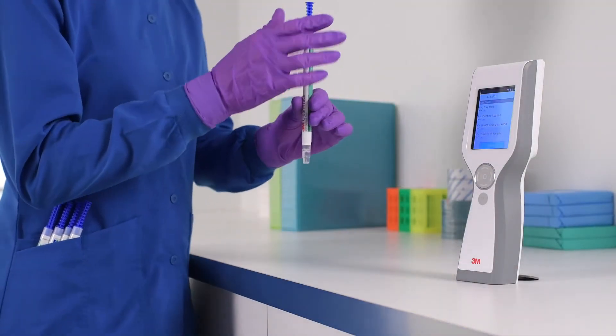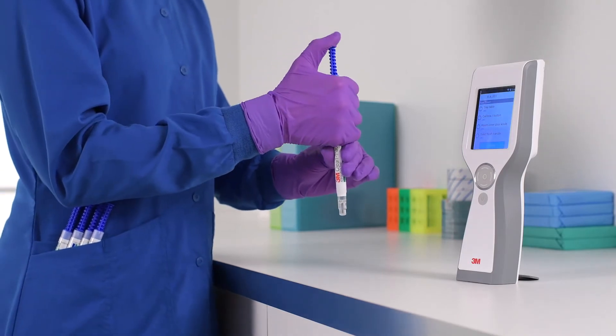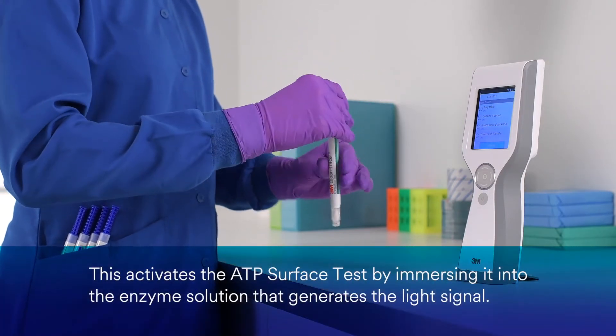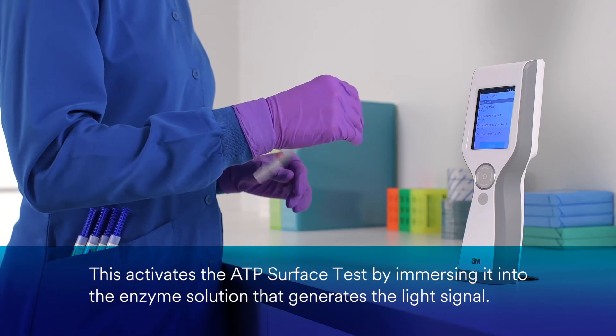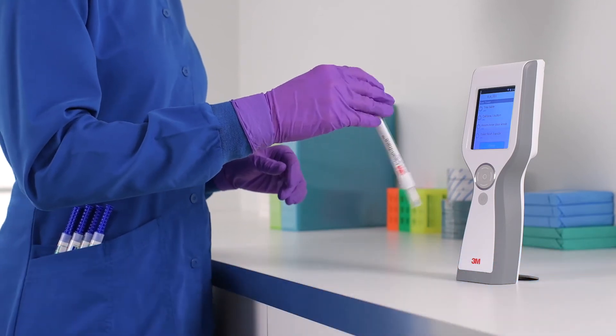When you are ready to activate and measure your ATP tests, press the handle down until you feel a click. Grip the top of the test and shake side to side for at least 5 seconds.